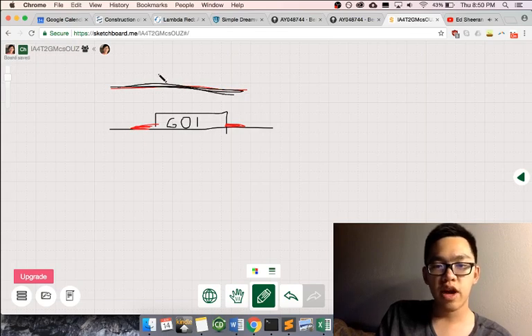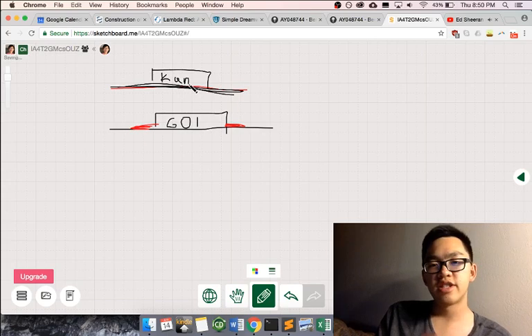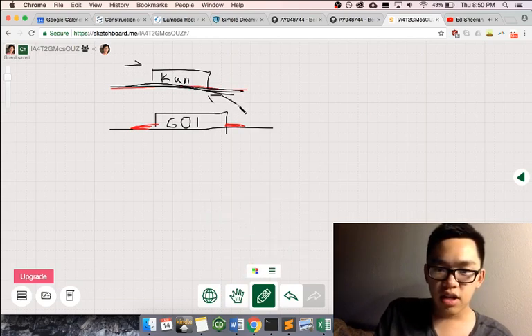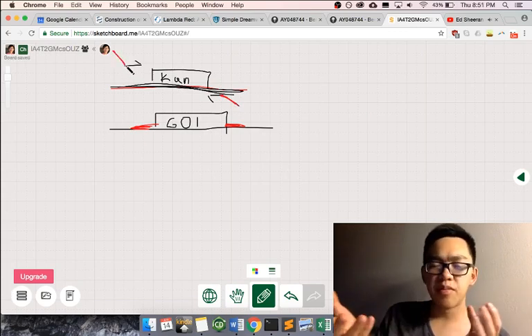with our kanamycin cassette. Our kanamycin cassette is simply an antibiotic marker that we can use to select for successful transformants later on. So in order to do this, you have to make a forward primer and a reverse primer, then PCR this product that has arms of homology at the end of these primers. These primers are approximately 50 base pairs in size.